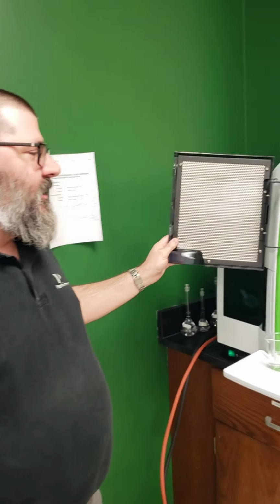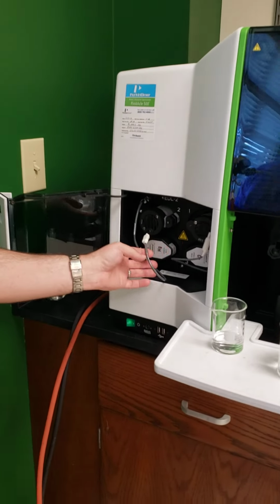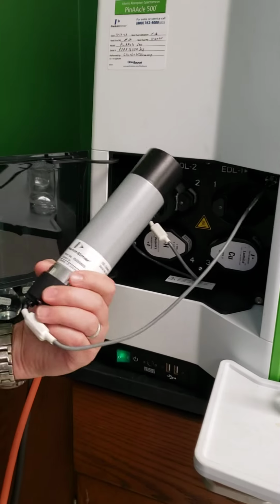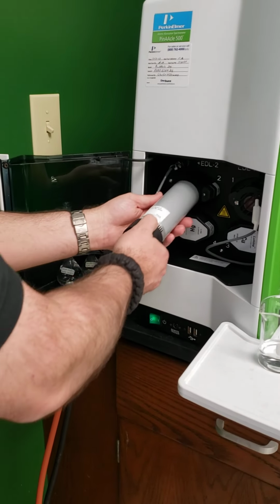This is an atomic absorption spectrometer. So what happens here is we have a lamp. Say we're going to do lead. There's lead. I need to turn that on.